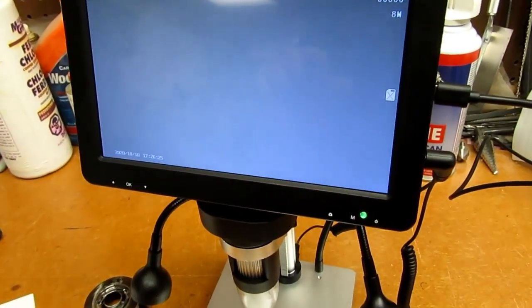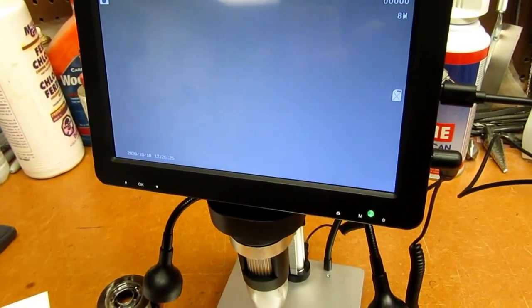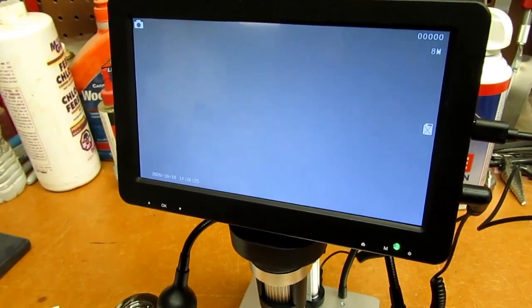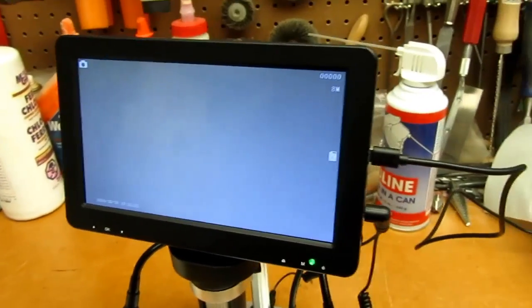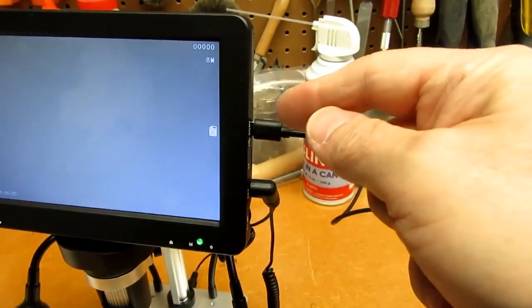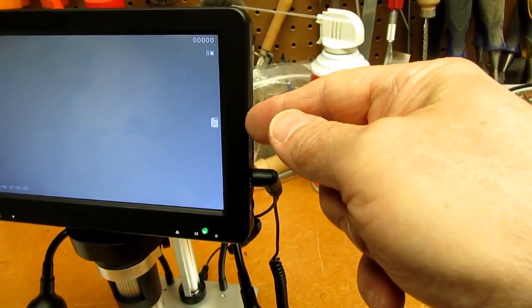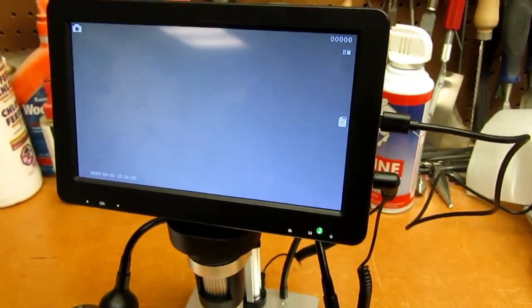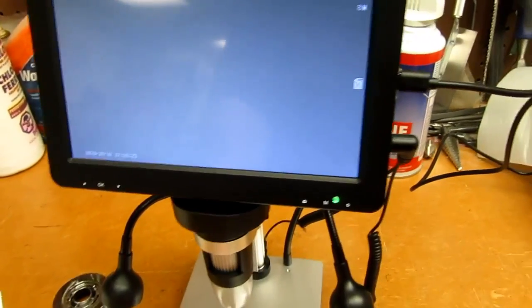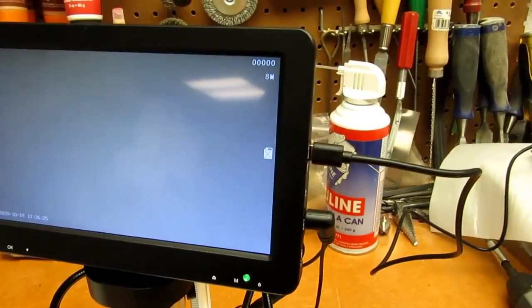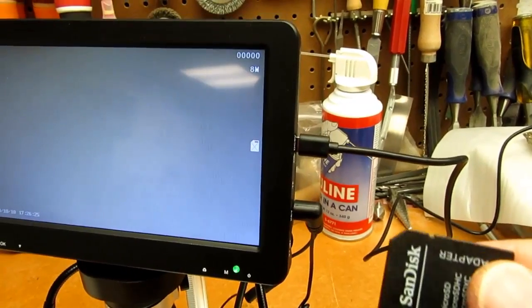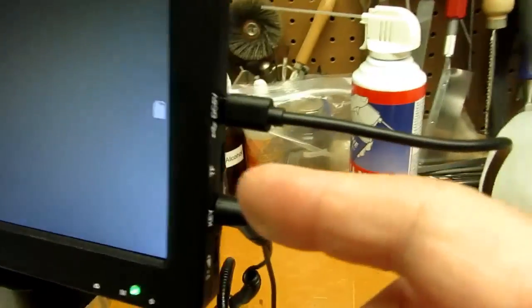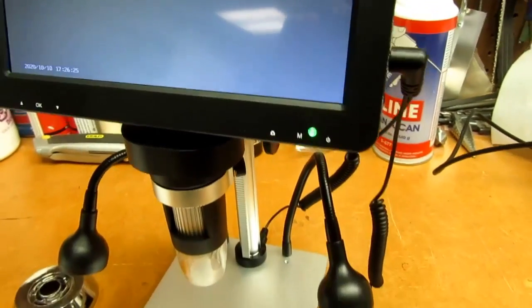You don't actually have to use that to use this microscope, but one of the modes of use of this microscope is as an auxiliary camera to a computer. So if you're going to do that then you do need a USB cable, probably from a USB-A plug to the micro USB that fits into this socket over here. If you're using it as a standalone not connected to a computer you don't, and if you don't need to take pictures or video you're just going to use it real time, then you don't need to add anything else in terms of memory. But if you do want to take pictures or take video with this and don't want to do it tethered to a computer, then you need an SD card and specifically you need a micro SD card.